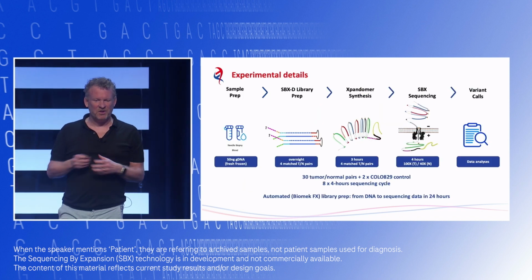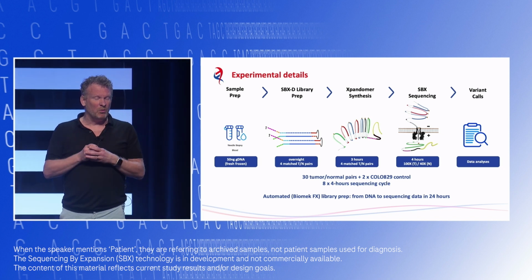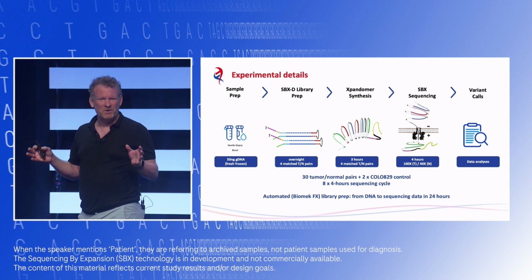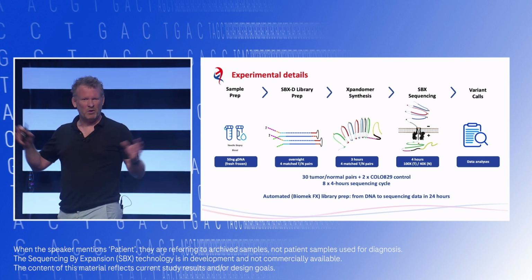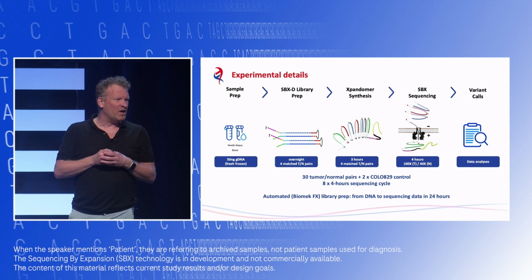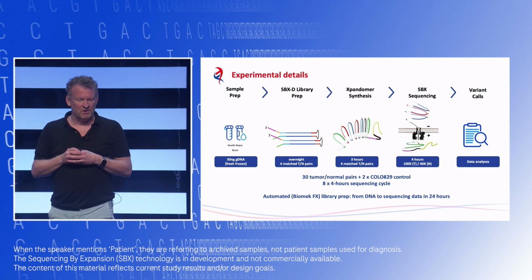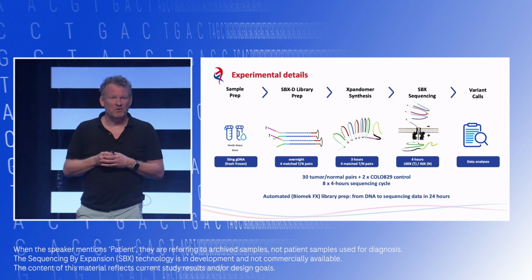I don't have to say anything about this whole process. Mark already explained that. I will talk about 30 tumor normal pairs and a COLO cell line control in duplicate. Be aware we do tumor normal pairs and we sequence, per sample, per patient, 4 genome equivalents. So this whole experiment encompassed in total a bit more than 120 30x genome equivalents, and that was spread over 8 4-hour runs. That was done on a single chip, and the sequencing was done over a couple of days to generate this data.